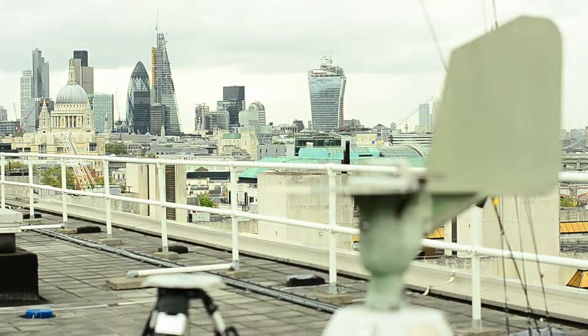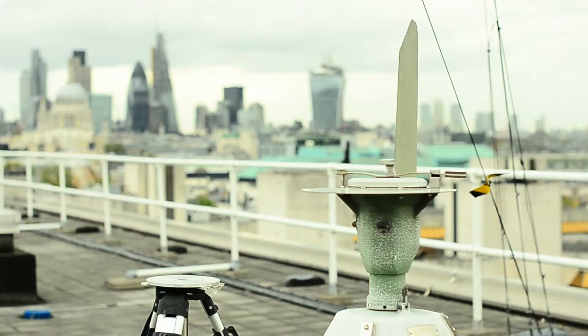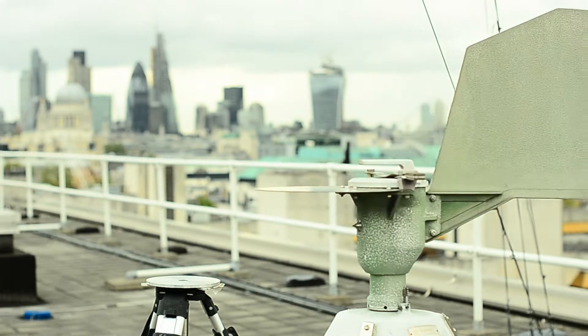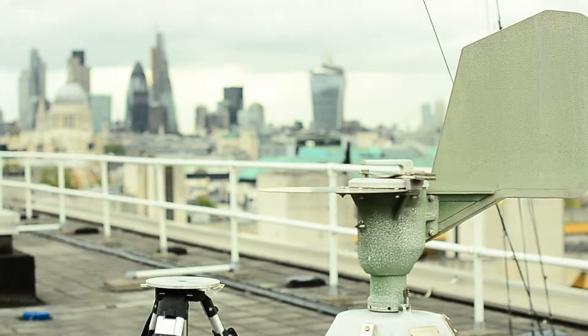This machine you can see is called a Burkhard Pollen Monitor and it's used throughout the UK for all of the Met Office's pollen network. There are also similar machines throughout all of Europe, so the Met Office's data will feed into the wider European network.